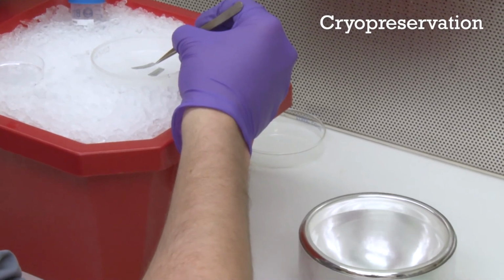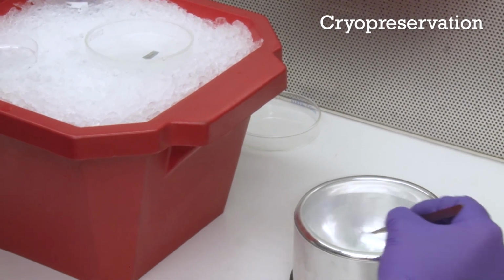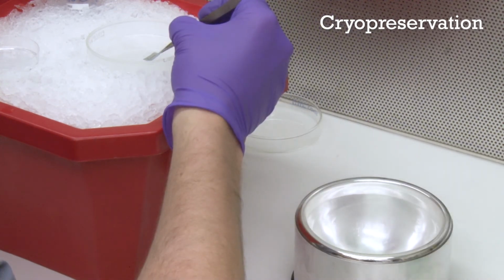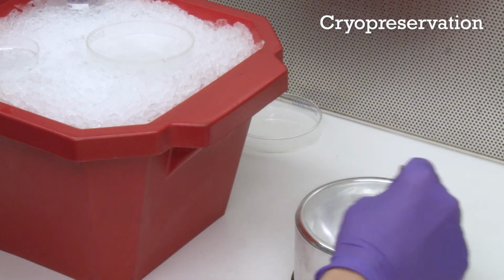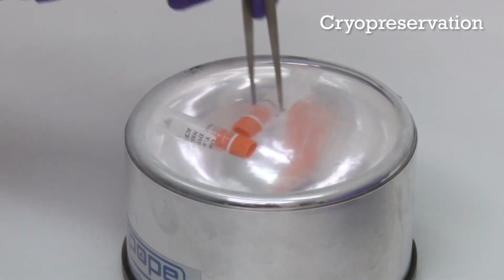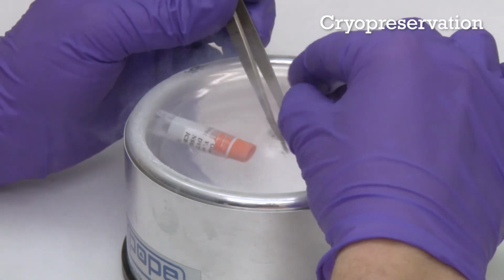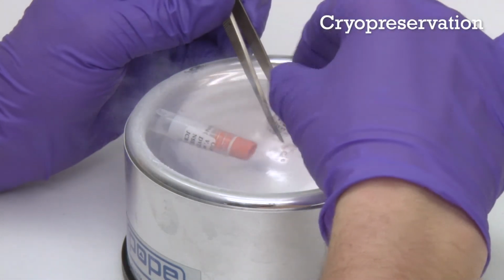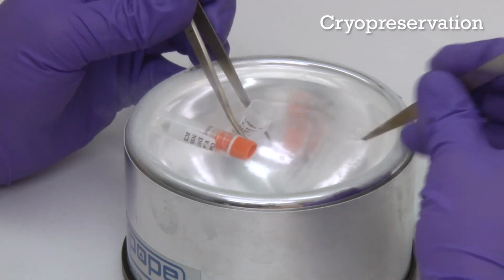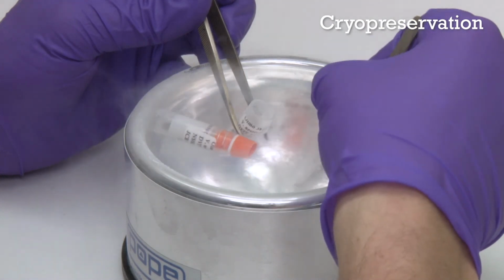And once you're ready, they are quickly plunged into liquid nitrogen, taking the forceps and quickly plunging them in. Move them around for a few seconds, and they're pretty much instantly frozen. Now we are preparing the labeled vials, transferring the foil strips with the shoot tips into the vials.